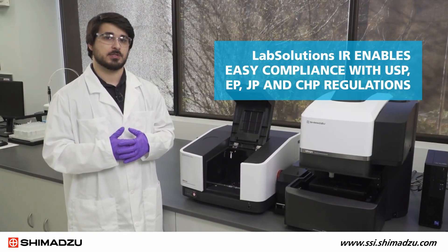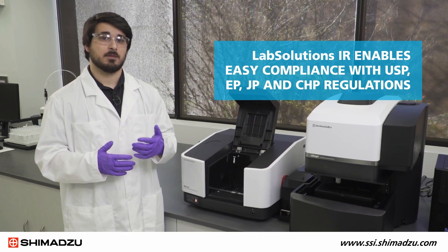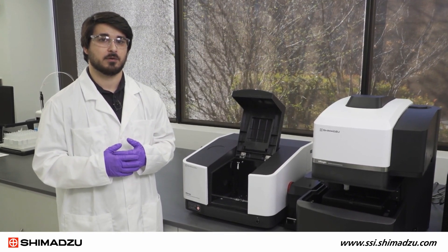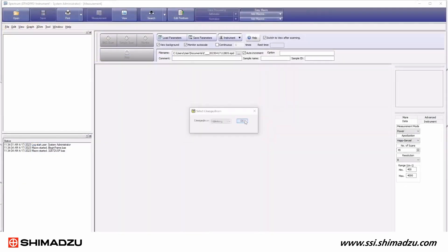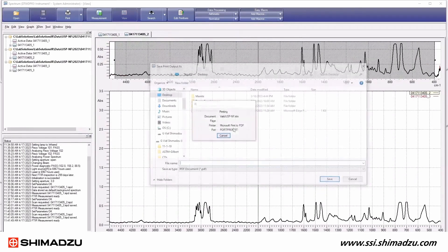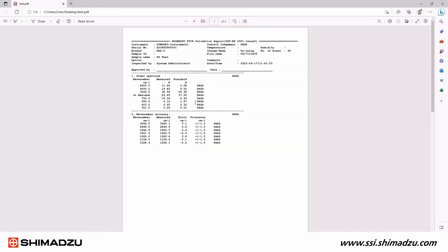The LabSolutions IR software enables easy compliance with USP, EP, JP, and CHP regulations by including a validation macro. Each of the different pharmacopoeia regulations are separated, and the user simply needs to activate the validation protocol. Once the macro is started, the LabSolutions IR software will guide the user through the steps and then print out a series of reports to cover the validation procedures set by each pharmacopoeia.